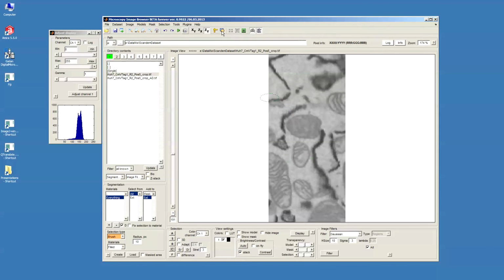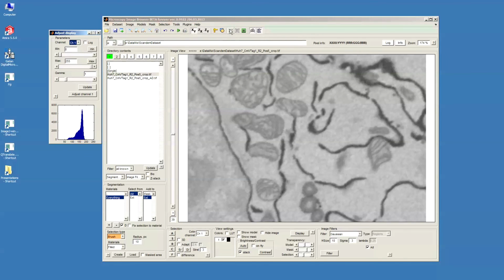The next tool offers a different way of shaping or line interpolation, which will be explained later in the segmentation tutorial. The other tool offers the possibility to work with the shown part of the dataset only.